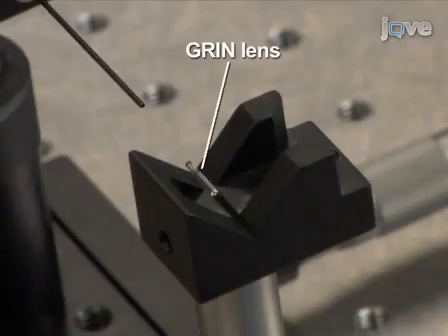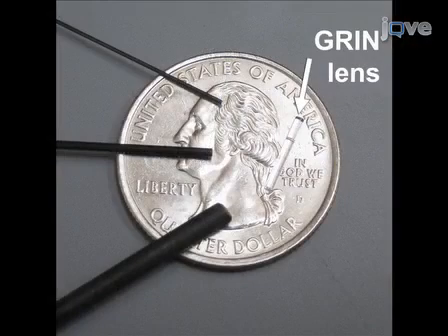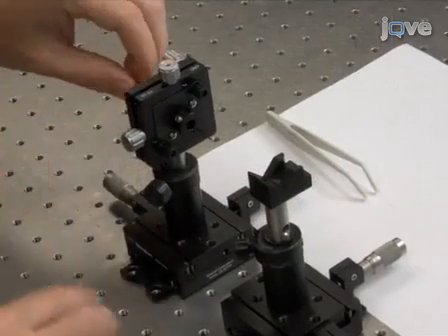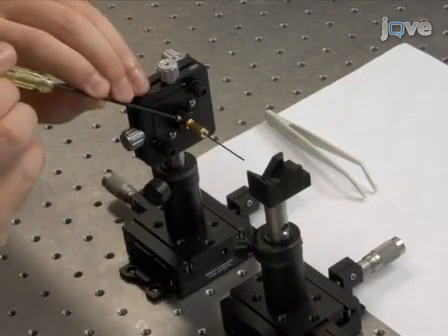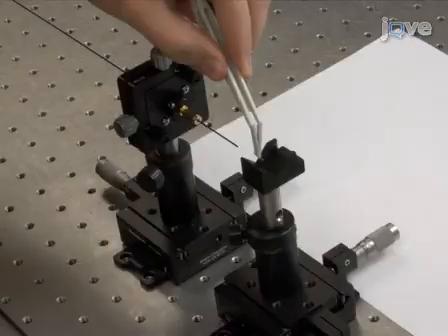Select a Grin lens with the desired magnification and working distance for your application. Ensure that the diameter of the lens matches that of the fiber bundle you plan to work with. Mount the fiber bundle and Grin lens on separate 3-axis manual positioning stages under a low-power microscope or stereoscope for accurate alignment.